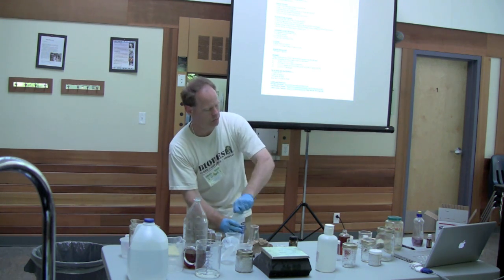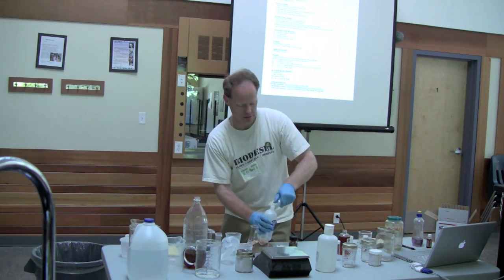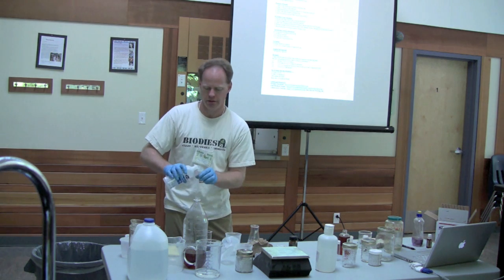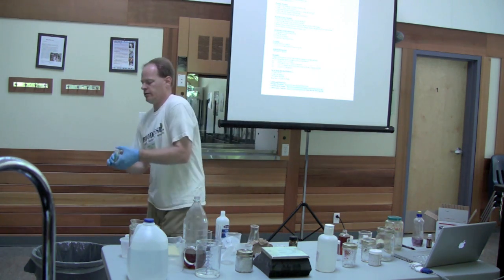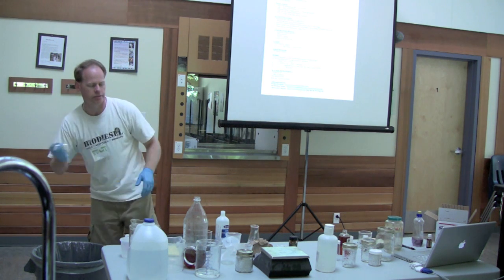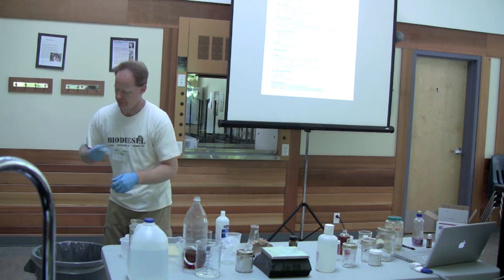I found these really cool vials a couple of years ago that are perfect for this test because they're marked at 27 milliliters. They're at 30 milliliters.